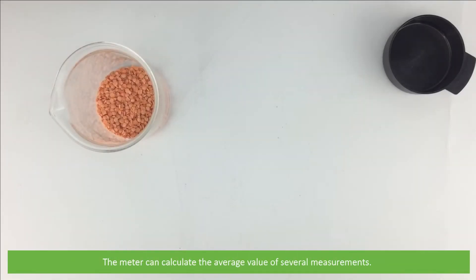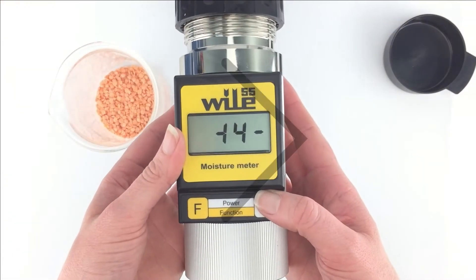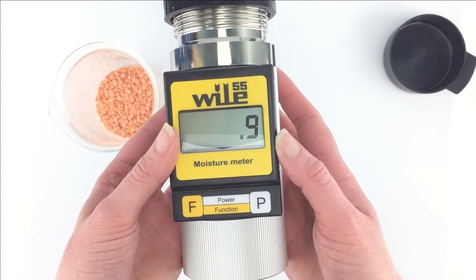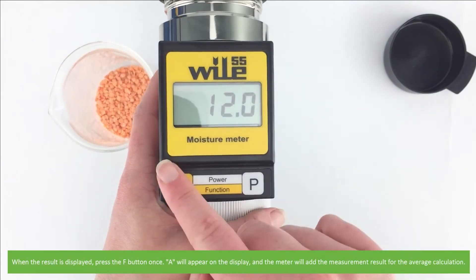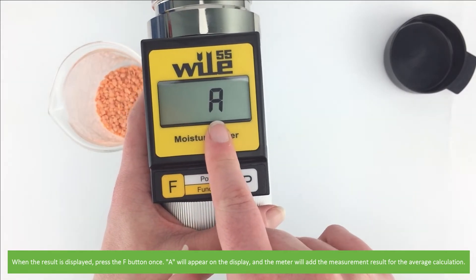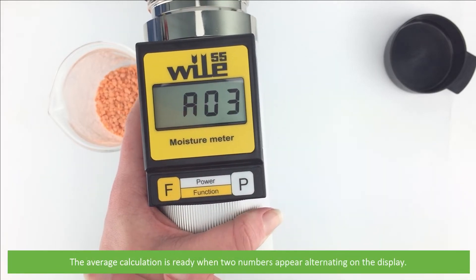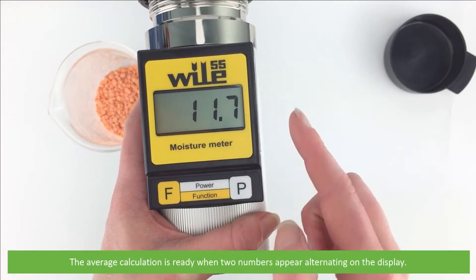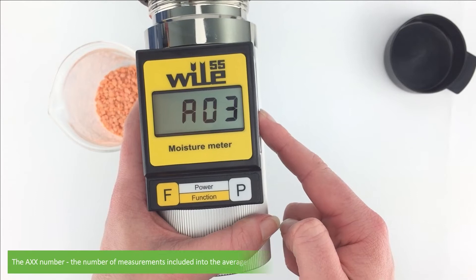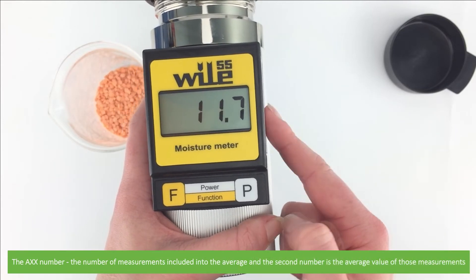The meter can also calculate the average value of several measurements. To do this, take the measurement as usual. When the result is displayed, press the F button once. An 'A' will appear on the display and the meter will add the measurement result to the average calculation. The average calculation is ready when two numbers appear alternating on the display — the 'A' number is the count of measurements included, and the second number is the average value of those measurements.